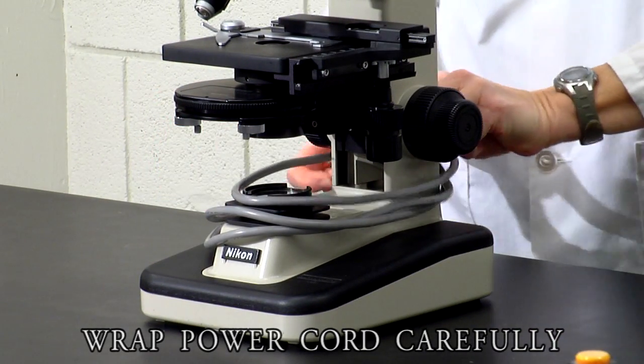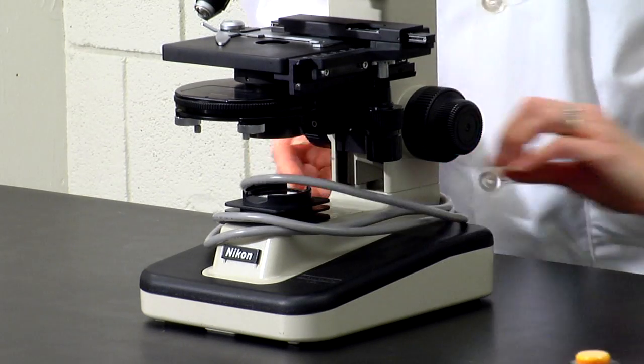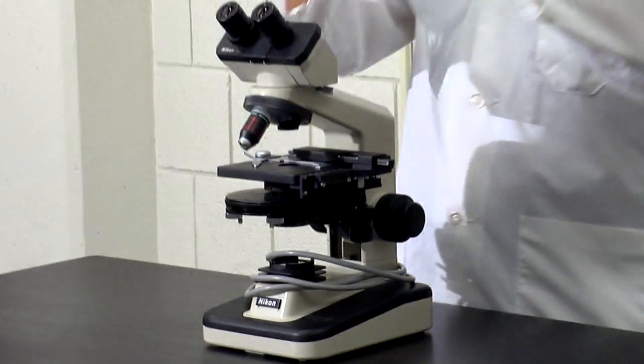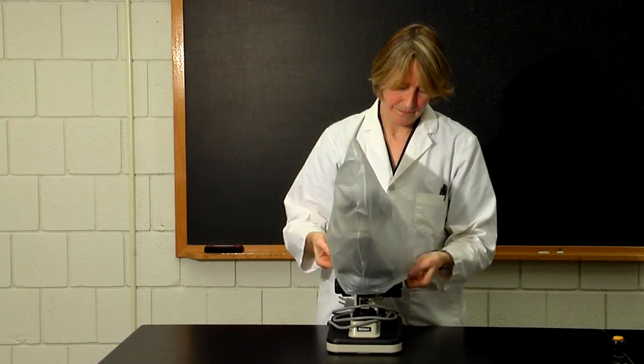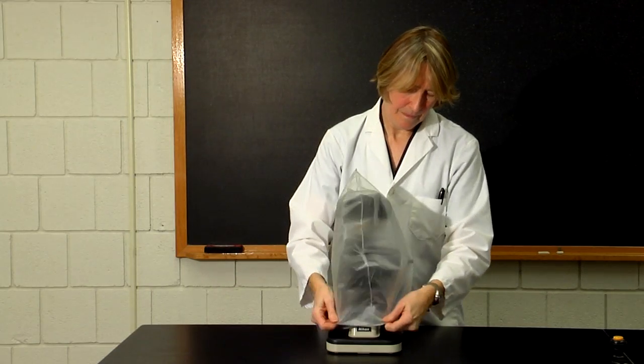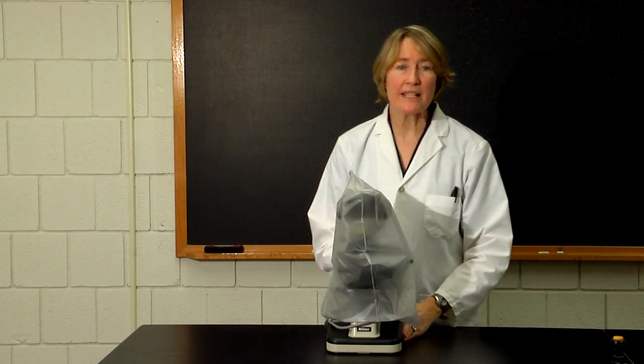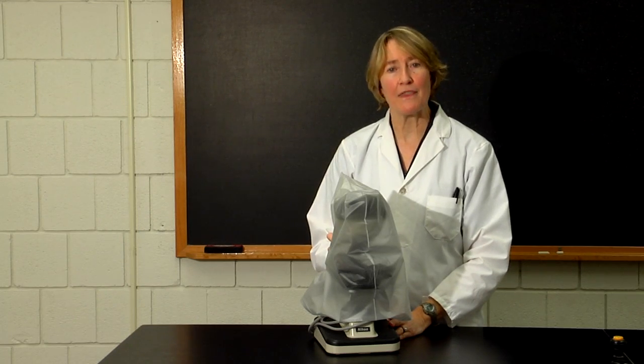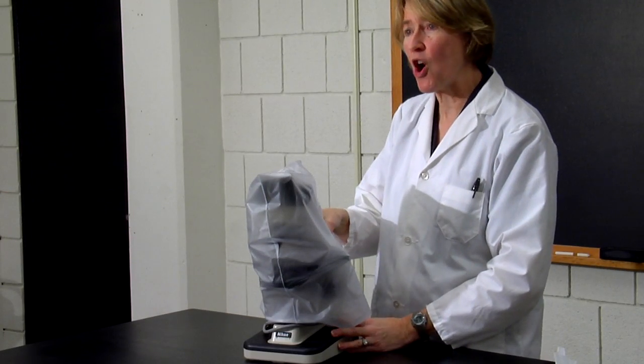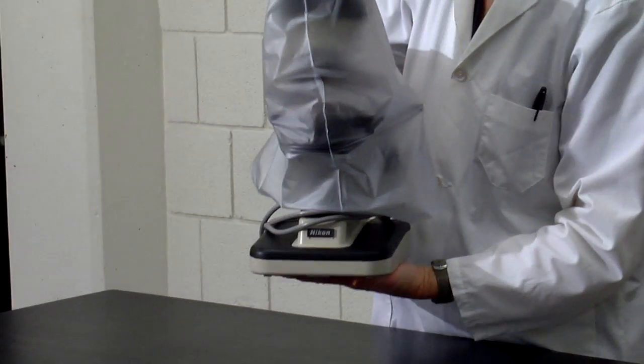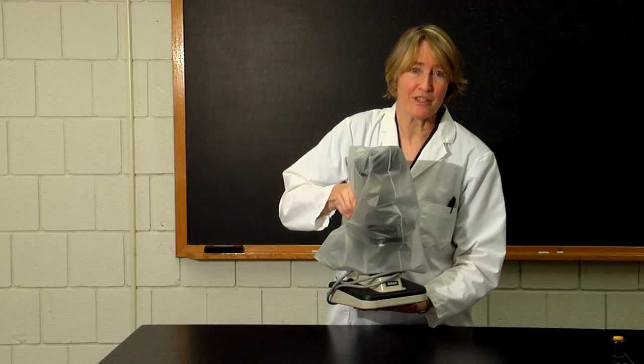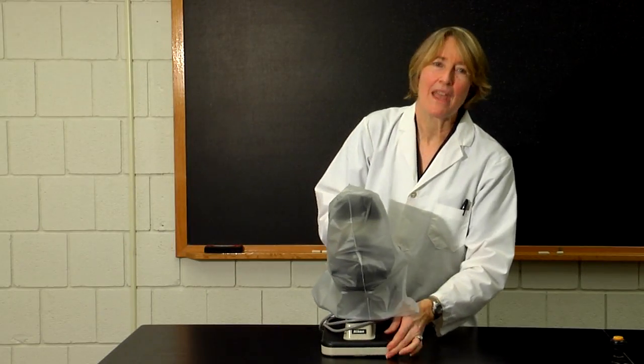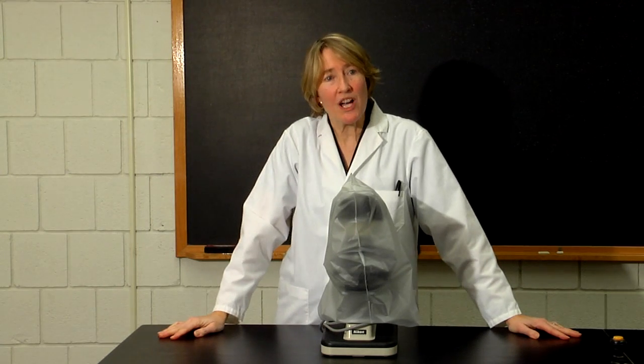Wrap the cord around just the way you found it. Replace the dust cover. And again, replace the microscope either in the cabinet by your bench or in the cabinet at the back of the room. Again, grasping the arm with one hand and another hand beneath the base of the microscope. And thanks very much for watching. We'll see you in lab.